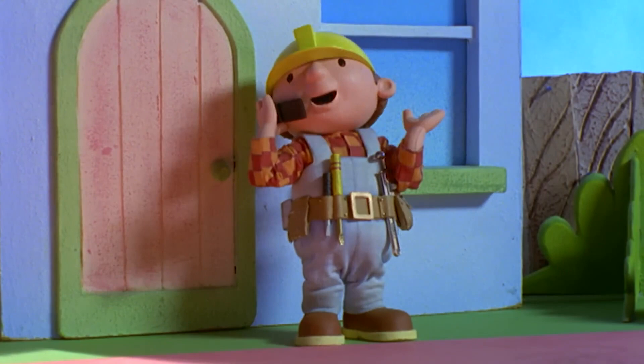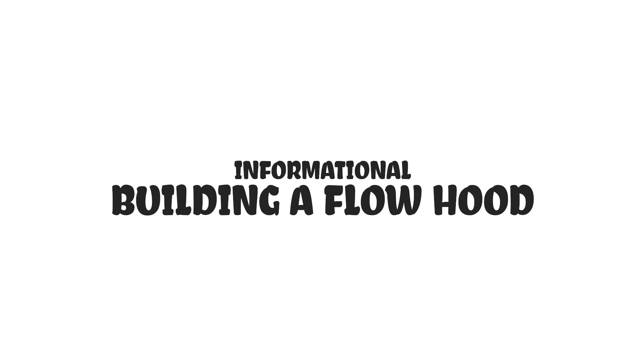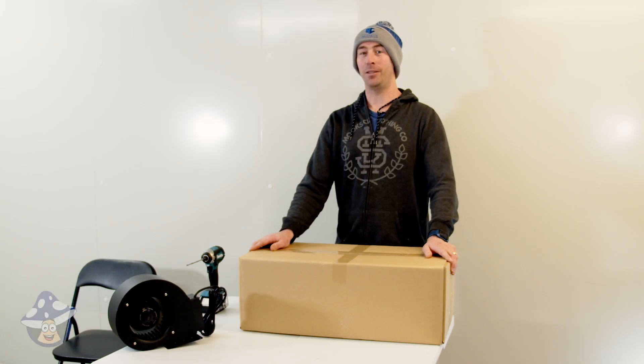Master Builder, can he build it? Nah, probably not. He'll likely just mess it up. And we're back. Let's build another flow hood.